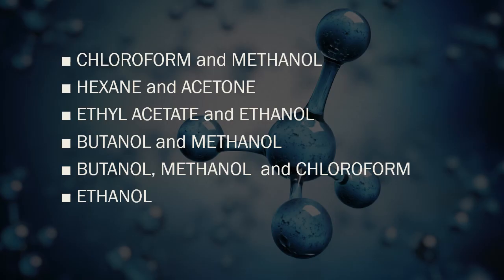Okay, and so moving on. You have here your solvents that can extract your cholesterol from the brain. The selection of the appropriate solvent is the most critical factor in the extraction of lipids.